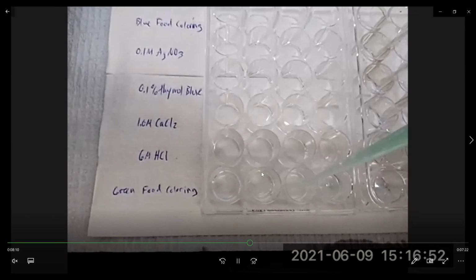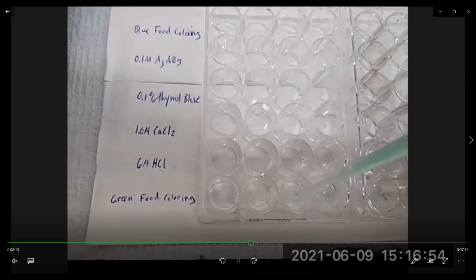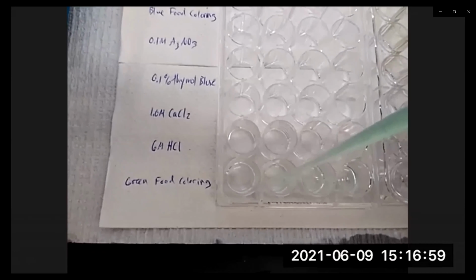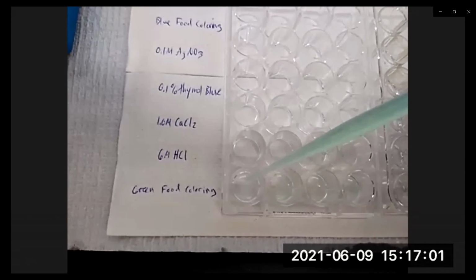So we're adding somewhere between around 5 to 10 drops of the reagent. And bear in mind that it may take a while for a reaction to occur.